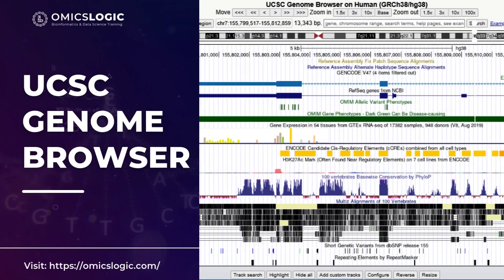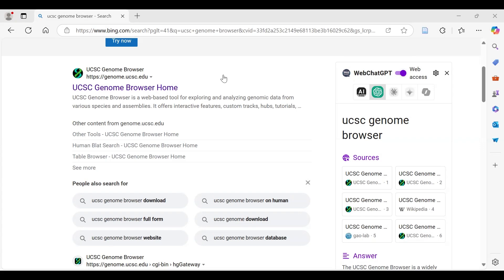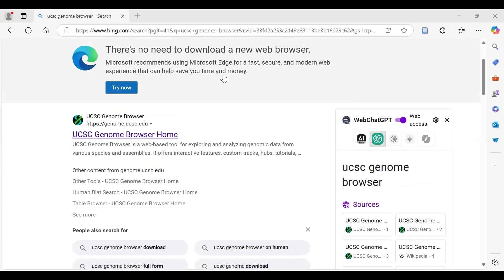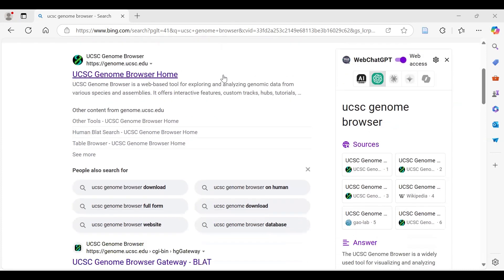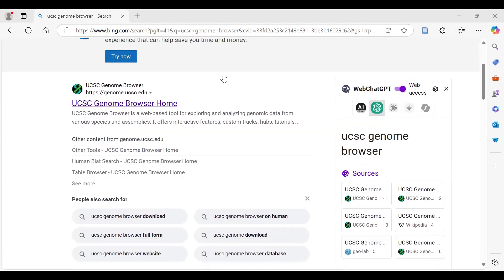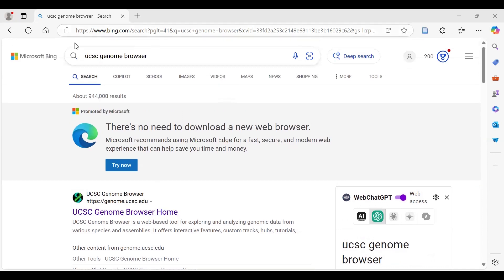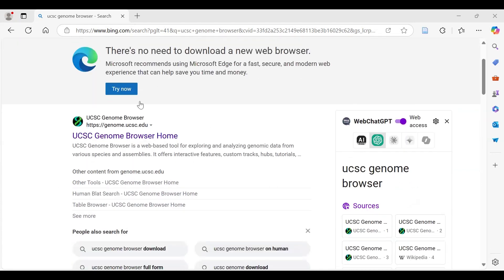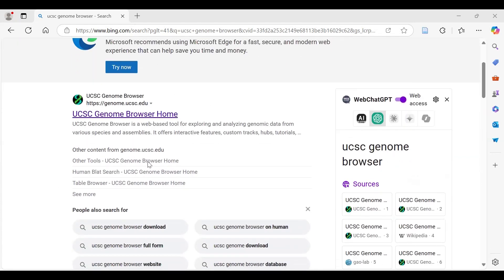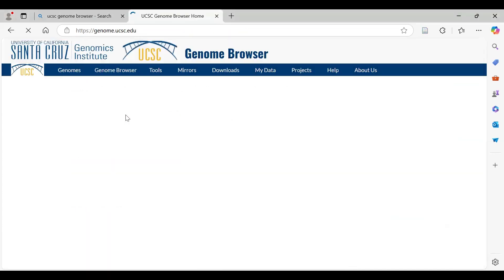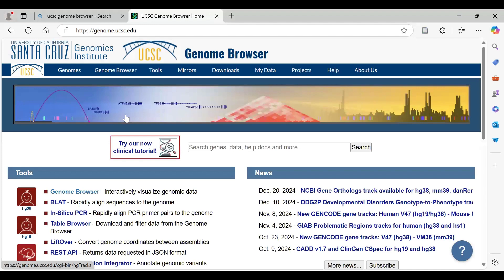Today we are going to talk about UCSC Genome Browser — how we can access it and what kind of information is available there. We simply go on Google or any browser, type UCSC Genome Browser, click on the first link, and the homepage of the Genome Browser will open up.